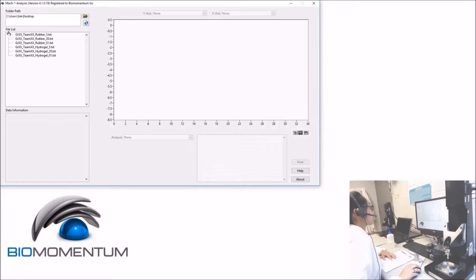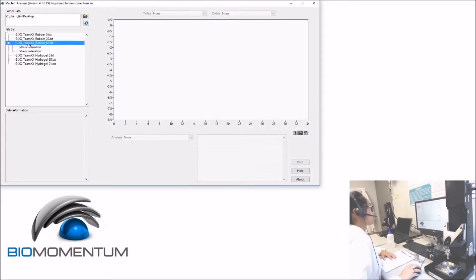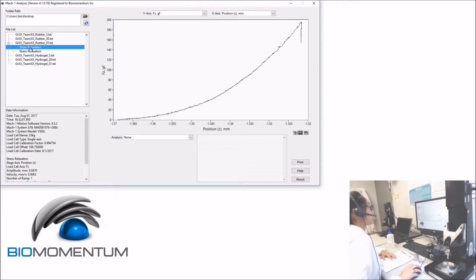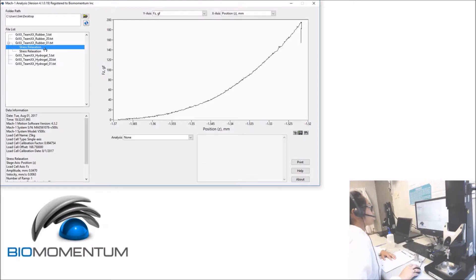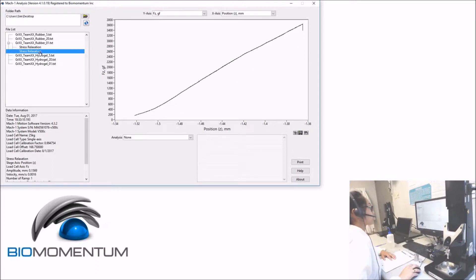From the file list, select the first result file from the rubber disk sample. The first stress relaxation corresponds to the pre-compression of the sample and will not be analyzed. The second stress relaxation curve will be analyzed.